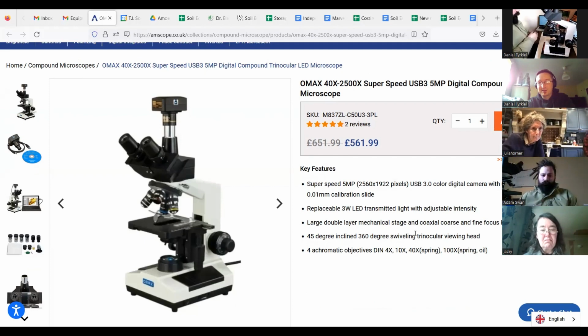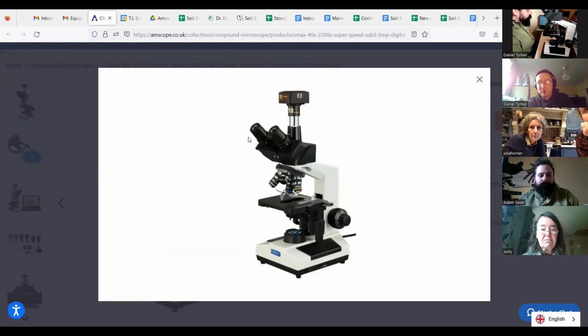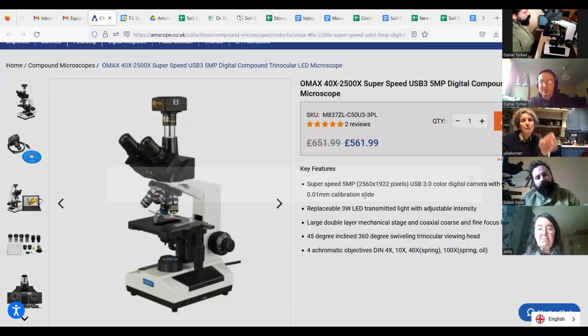It's interesting that this is obviously a Chinese production that's been on the market for quite a while. What's interesting is that it's a direct copy of an old Olympus CH4, which was a microscope sold by Olympus in the 80s. And I really like how the oculars are actually mounted. They're not on a swivel, but they go side to side when you adjust for the width of your eyes. I found that the swivel can break in some microscopes and they just droop. And here you really don't have a chance of doing that. But this is basically what we would use.